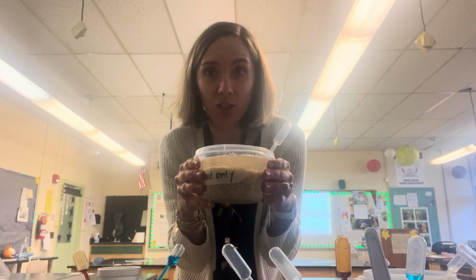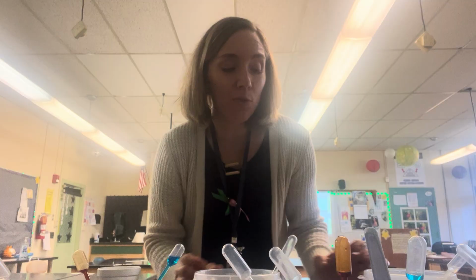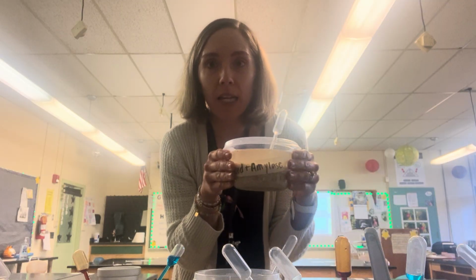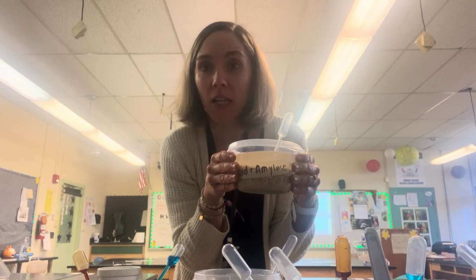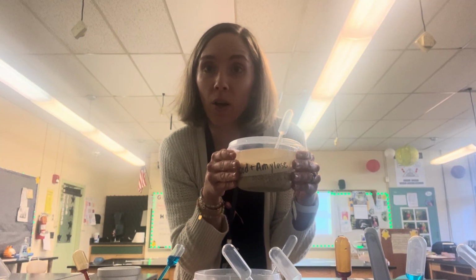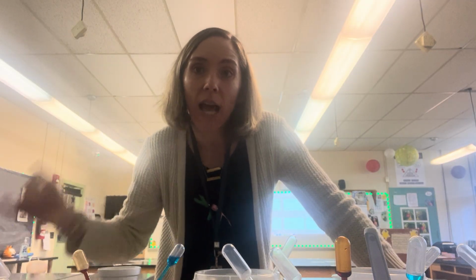The food on its own only had starch in it. However, the food, when it's exposed to amylase, allowed for a chemical change to occur where some of the starch, the complex carbs, broke down into glucose, a simple carb, which is a new food molecule. So this is an example of a chemical change that is happening in our mouth as a result of the saliva.